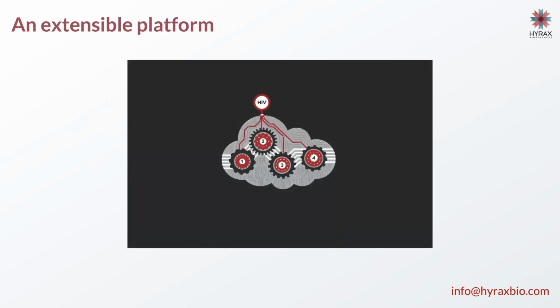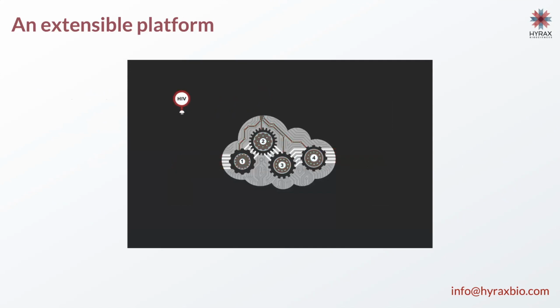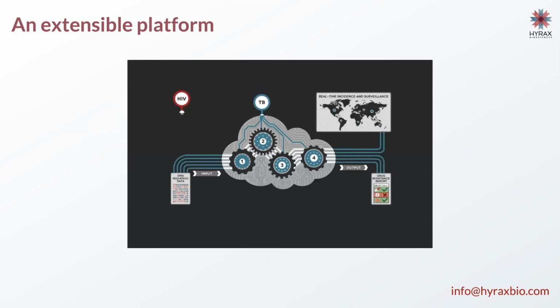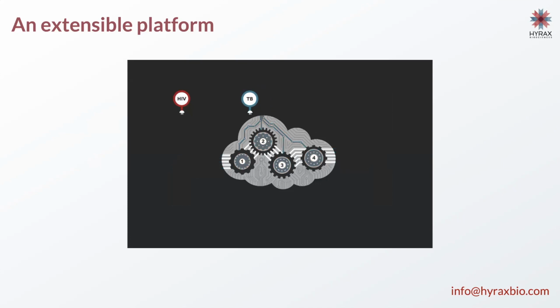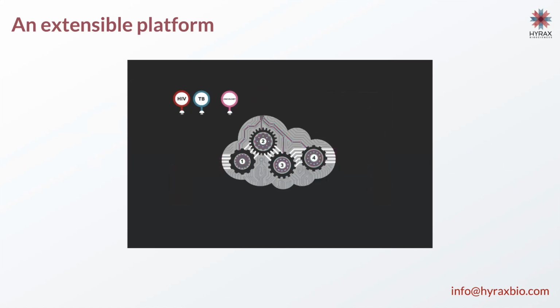And just to step back for 2 slides, just to give you an overview of Exatype as a platform. So we've very specifically spoken about it as a SARS-CoV-2 clade and lineage typing solution. But really, Exatype is, as I mentioned earlier, a disease agnostic solution. So we think of the underlying platform as being the algorithms that drive and power it as a solution. And essentially, we develop what we call plugs that fit on top and utilize the power of the platform to convert it into a disease-specific or an application-specific tool.